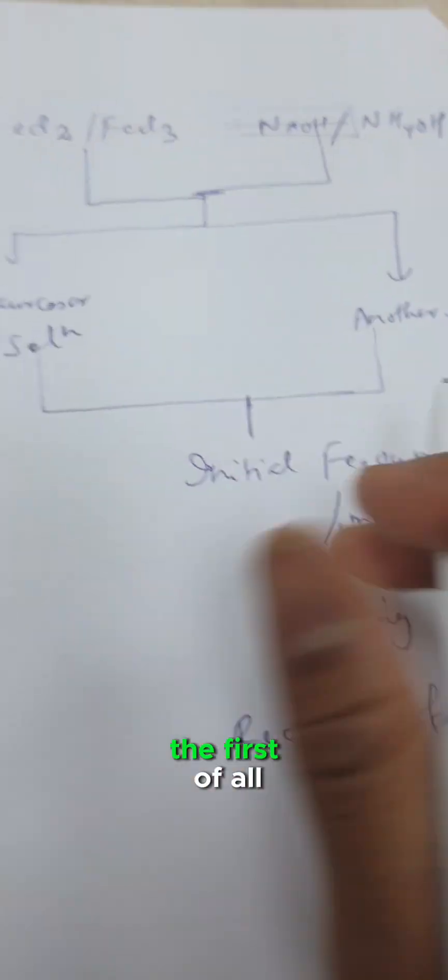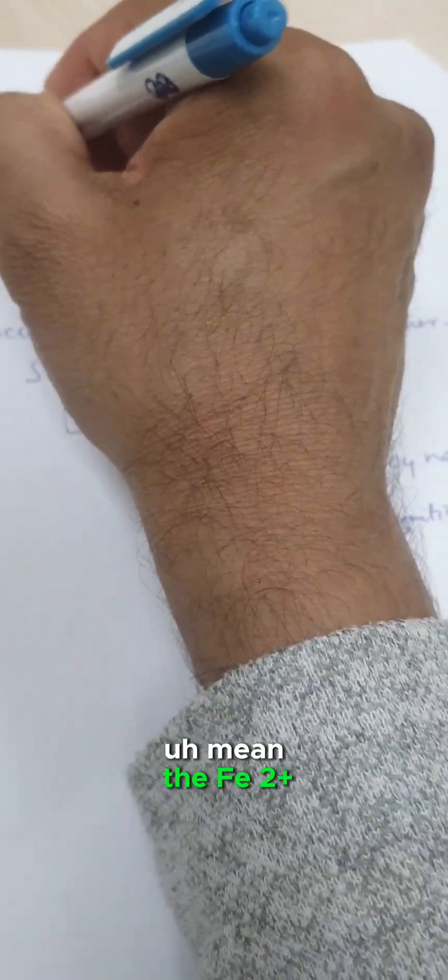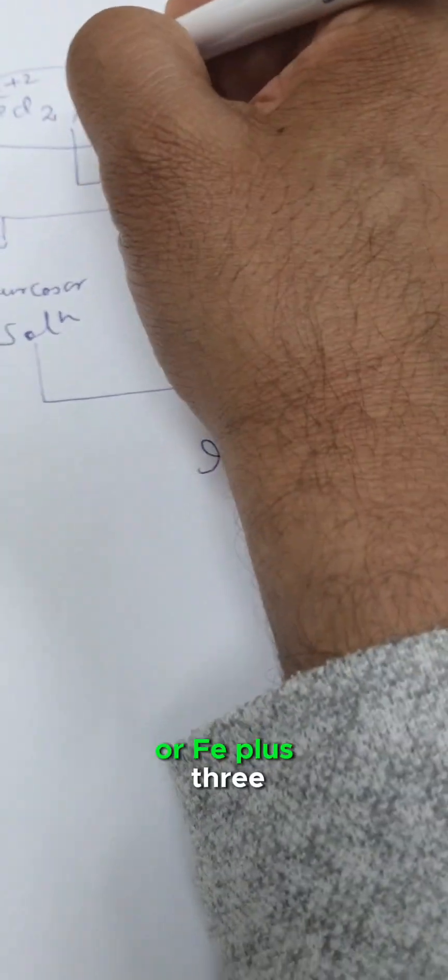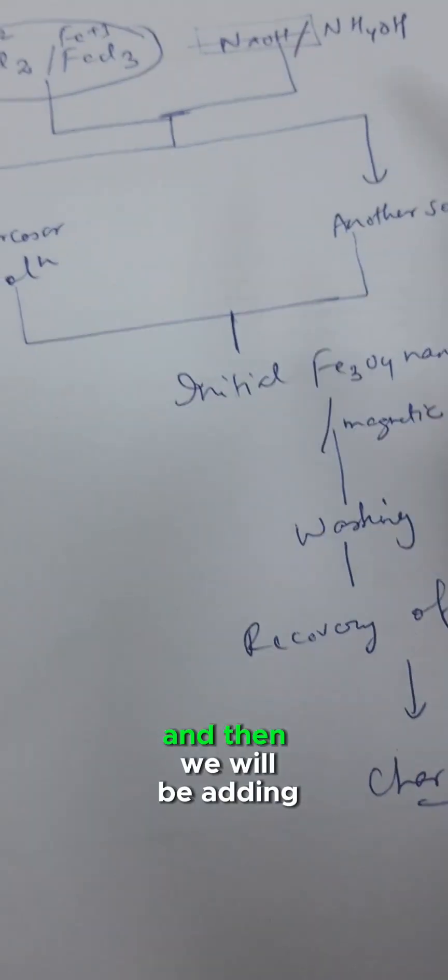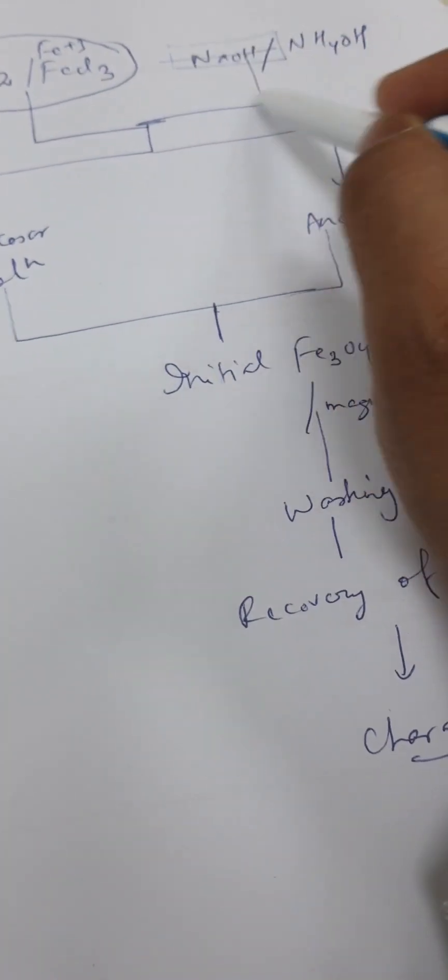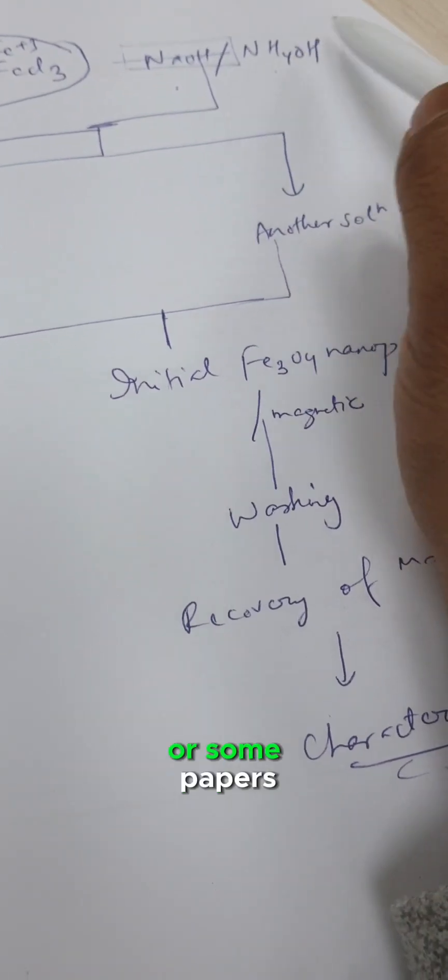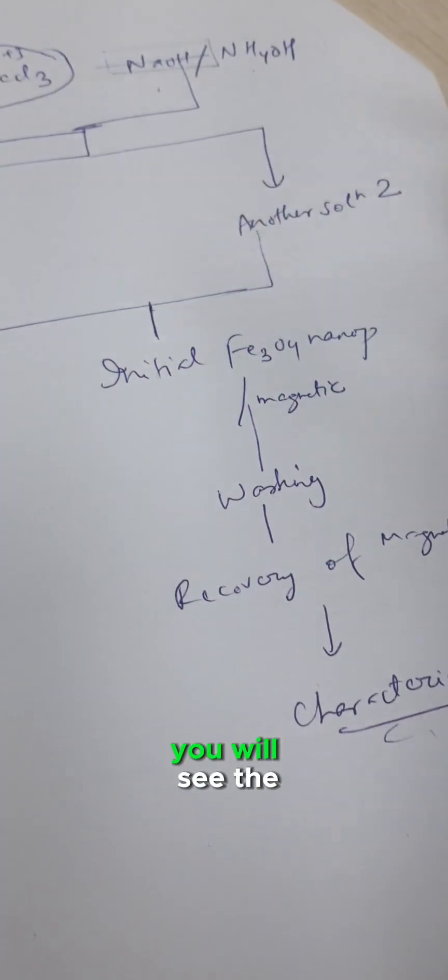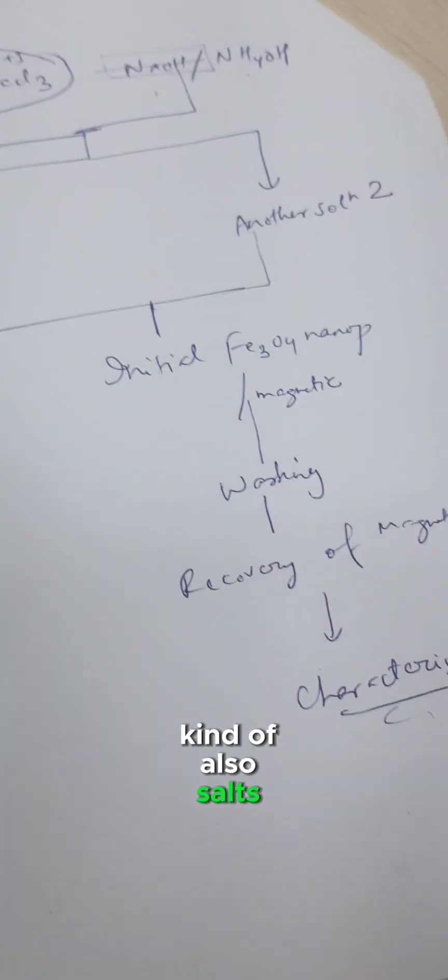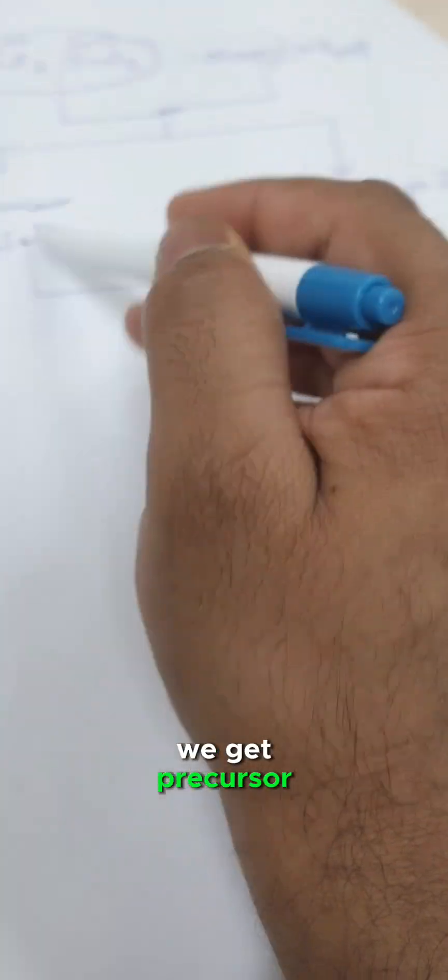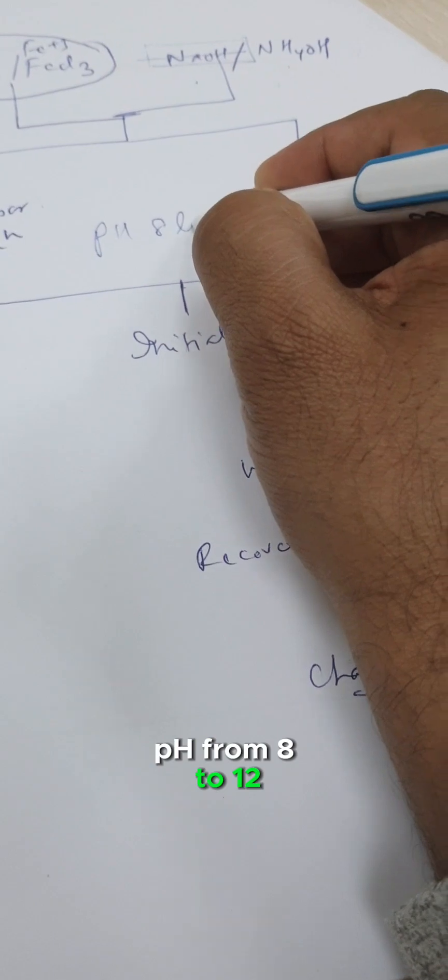The co-precipitation process is shown in the following diagram. We can see here first we'll be taking Fe2+ and Fe3+, mixing this solution, and then adding base—either NaOH, NH4OH, KOH, or some other salts. After mixing we get a precursor salt solution with pH from 8 to 12.